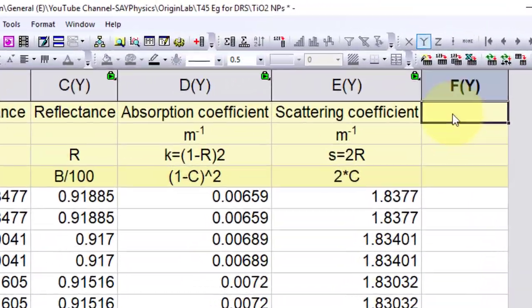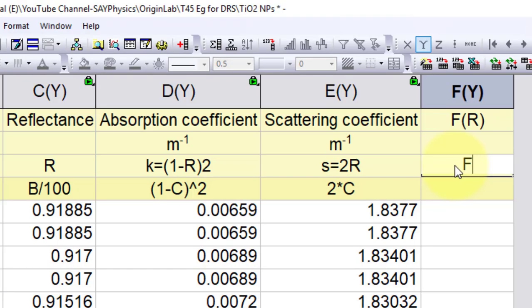Now it is time to calculate F(R), which is k over s, so we can write it as column E over column F.